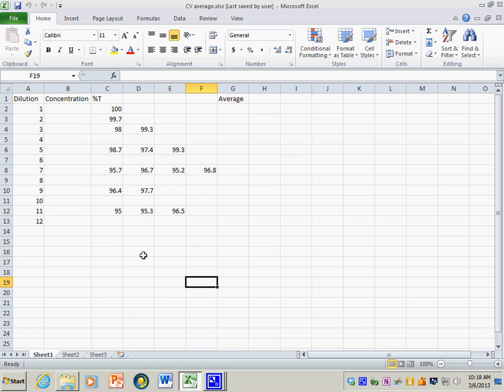First things first, this is my data. I did remove some of the data just because it didn't really make a whole lot of sense. So I'm just going to be adding the further analysis from this data.